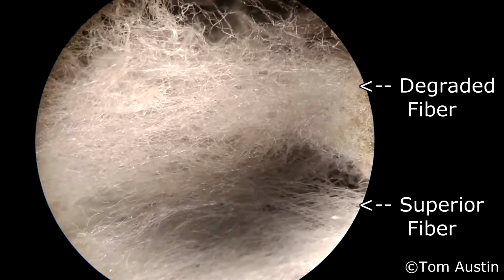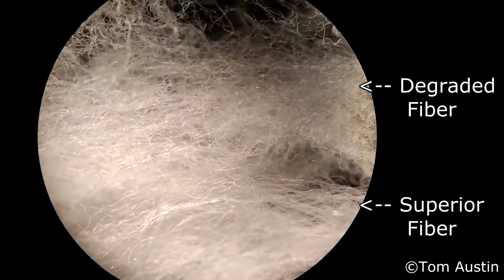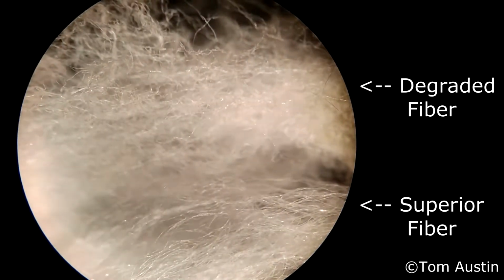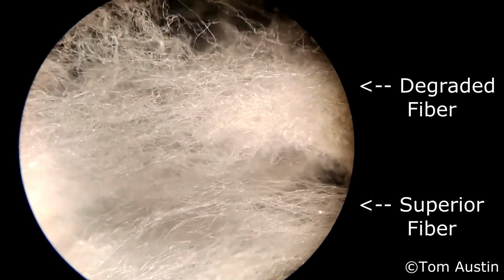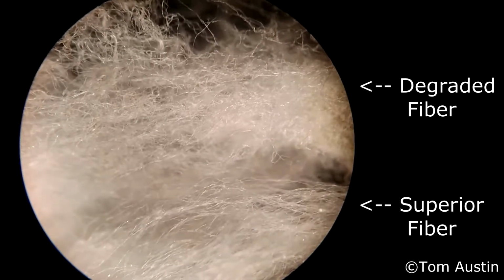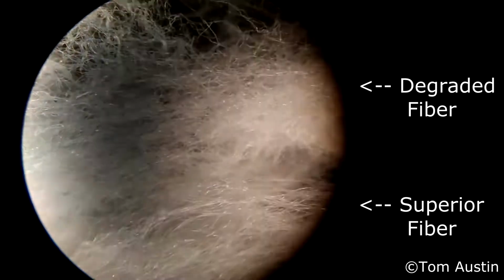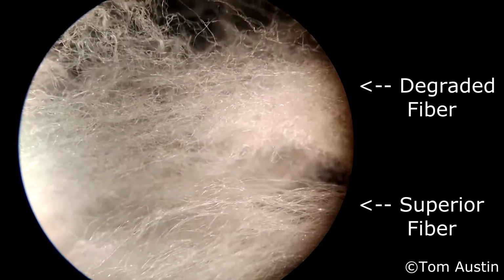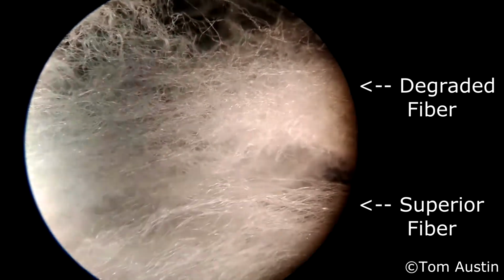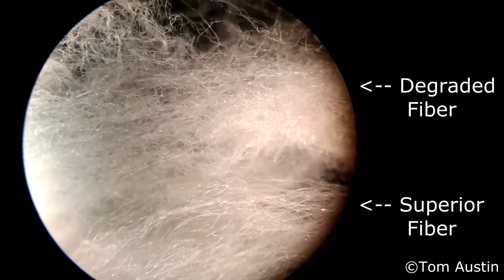And part of that too is just because I can't straighten out the stuff on top because it tears apart whenever I try to straighten out the fiber to examine it. There, I don't know if you can get a slightly better look at that. The microscope does not focus exactly through the phone where my eye does, so it's a little hard to get this set up, and I don't have a proper setup, so I'm just sort of holding this in place above the eyepiece. But yeah, look at the bottom right and then compare that to the upper left. Just no contest, completely different game.